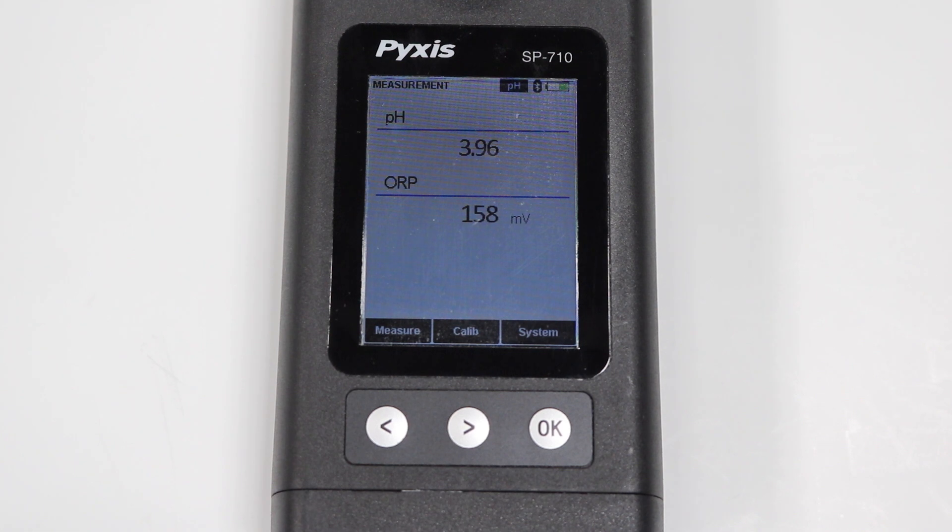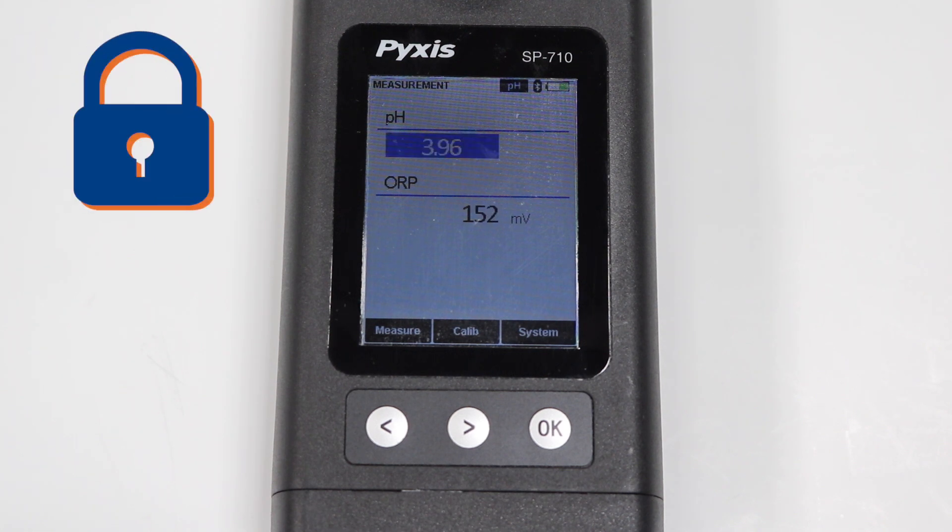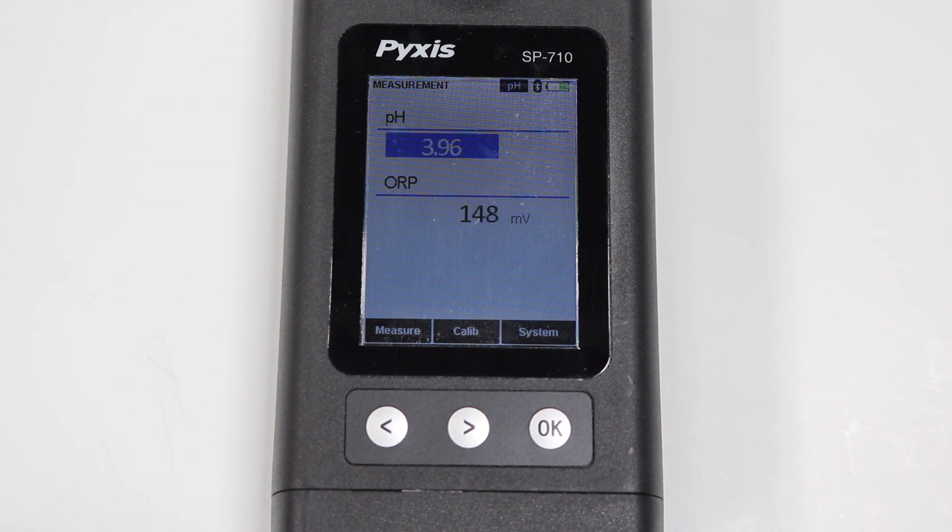Our new design incorporates a color screen with sample lock-in capability, where the annulet measurement is highlighted in blue after the sample has fully stabilized, eliminating concern over sample drift.